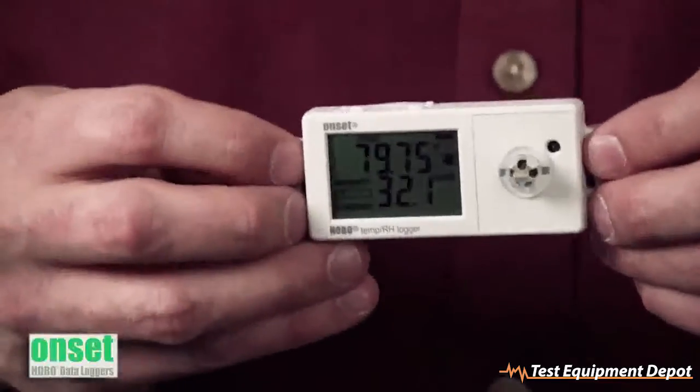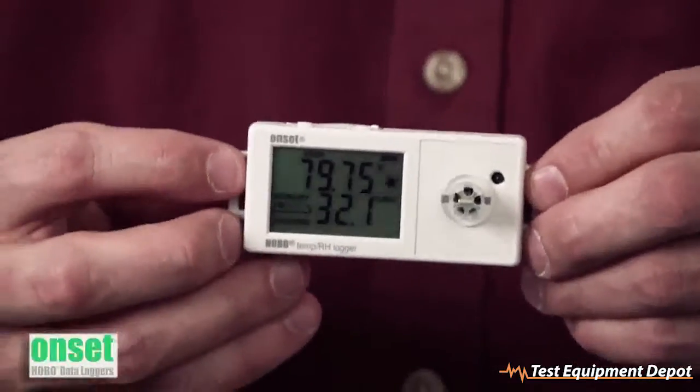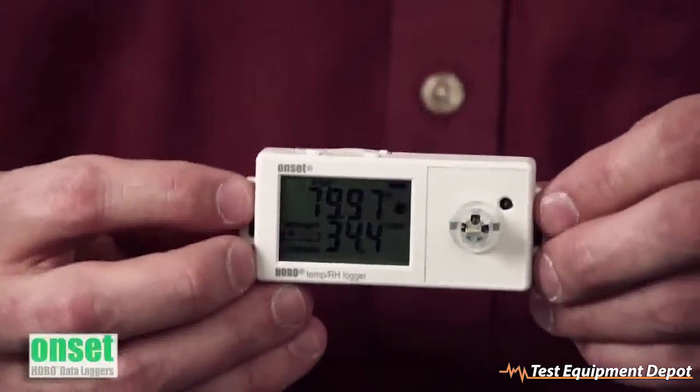One of the key features of the UX100 product line is obviously the LCD, as you can see here on the front. It gives you real-time feedback, and it's updated every 15 seconds.